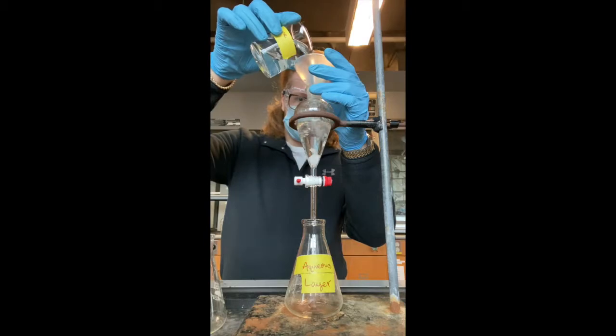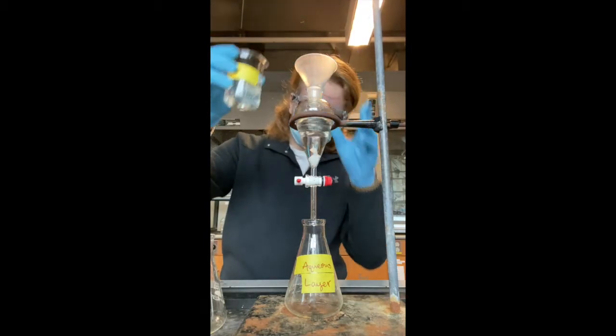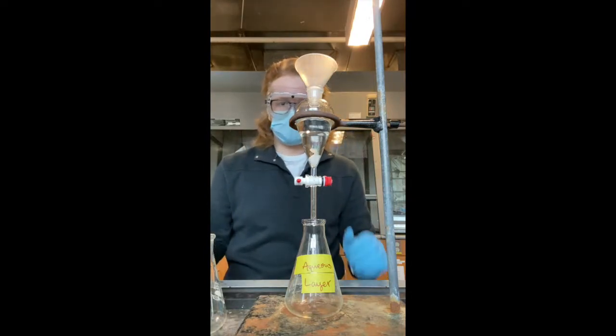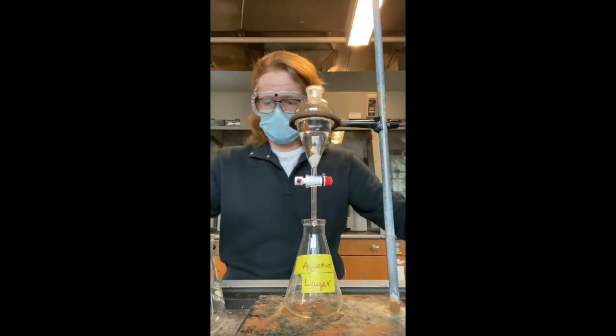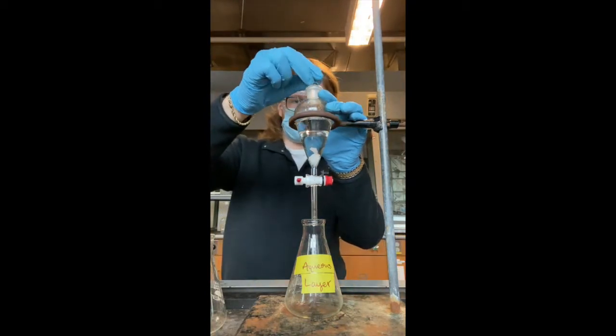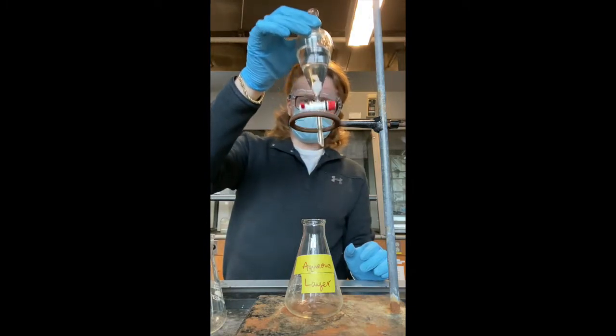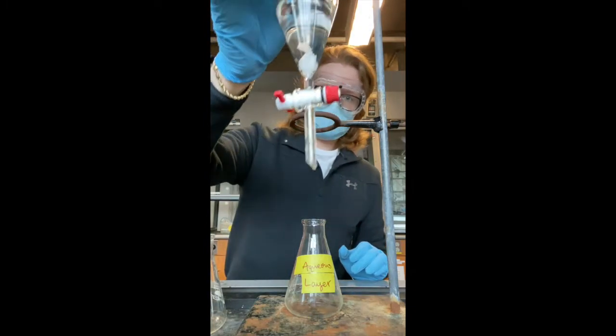I am extracting benzophenone from its mixture with water with the solvent hexane, as hexane and water are immiscible, but benzophenone and hexane are miscible, allowing hexane to extract benzophenone from its mixture with water. I chose to use benzophenone as the compound being extracted, so as a viewer you are able to witness the hexane extracting out the compound from the water.